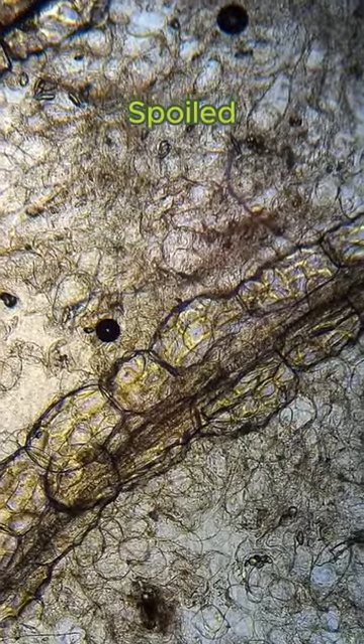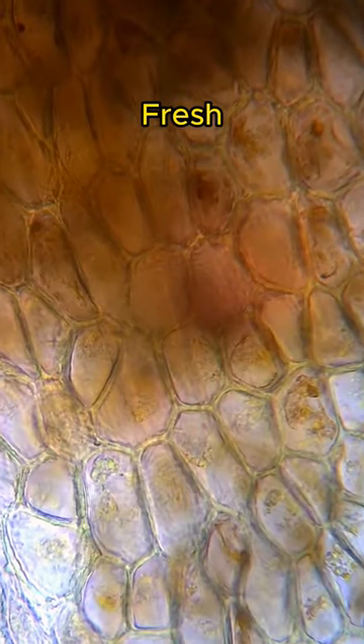This is not a worm. This is how banana looks like under 100 times magnification. Look at all these dancing fellas. After observing both spoiled and fresh bananas, I couldn't find much difference between them.